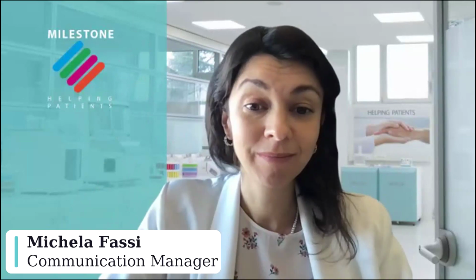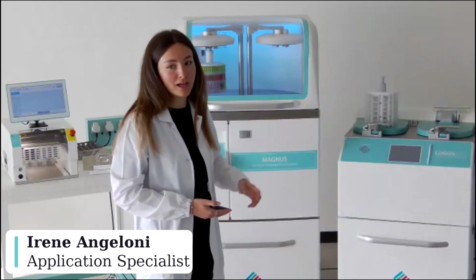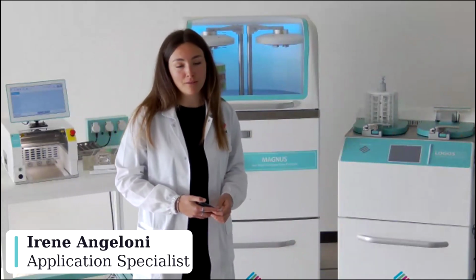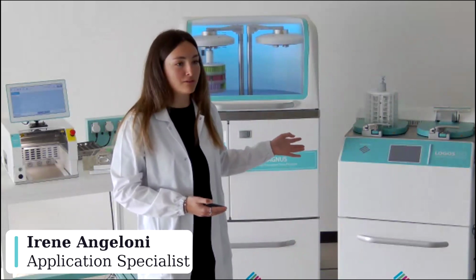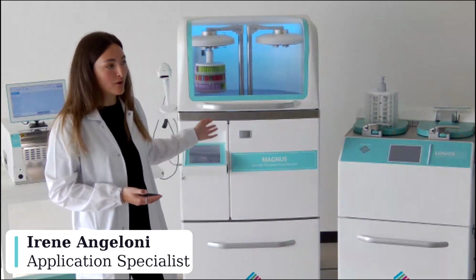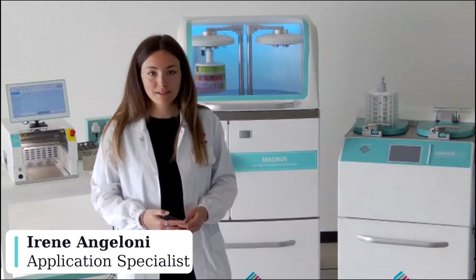Okay, thank you again. And linked to your answer, we have another question again regarding the split manifold. Is that available in Logos as well? So the split manifold is present in Logos Evo. That is this one that I have here together with Magnus. So in Magnus and the Logos Evo, we have the split manifold. I think Logos Evo is the last one, and Magnus some years ago. From Magnus on, we have this kind of configuration of the manifold.